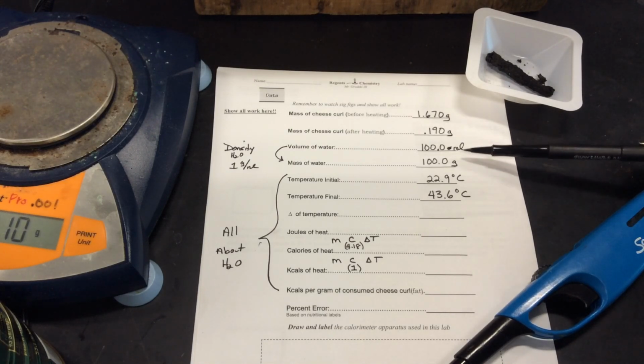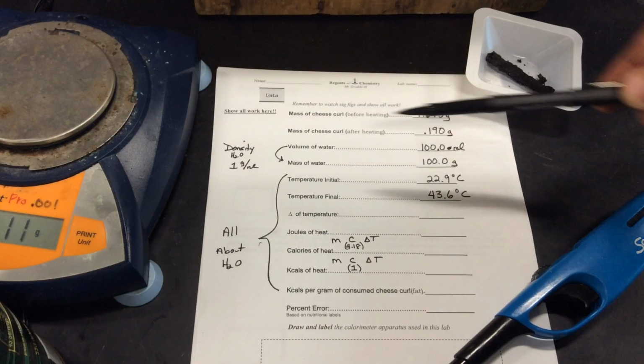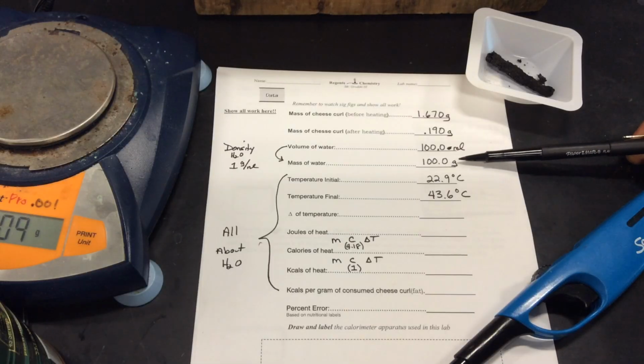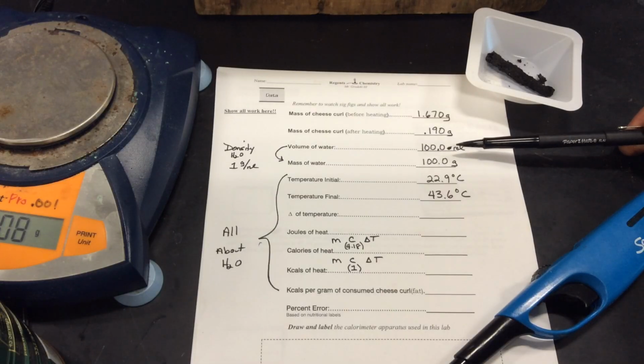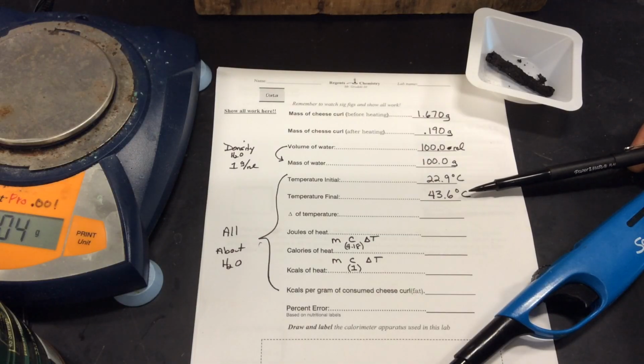We have the mass of my water. Well, actually, I have the volume of my water, which I know using density is 1 gram per milliliter. It's exactly 100.0 grams, because of the measuring using the graduated cylinder. Now the initial temperature of the water we agreed was 22.9 degrees Celsius. After we burned the Cheeto, the water absorbed energy because it was an exothermic process. The environment's temperature increases, so it went to 43.6. That's our last measurement of the water.